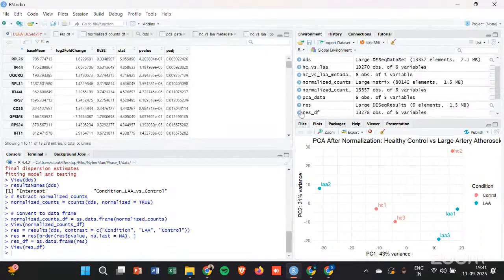And so you see that it has calculated it for the 13278 genes that we had. You can see that some of them have still been removed. Those were actually the NA values. For some of them it probably could not calculate the log fold changes or the p-values, or maybe the p-values or log fold changes are not actually defined in R. Maybe they are NaN values or Inf values, so infinity.